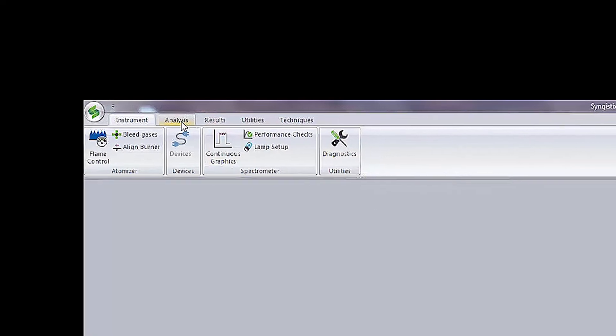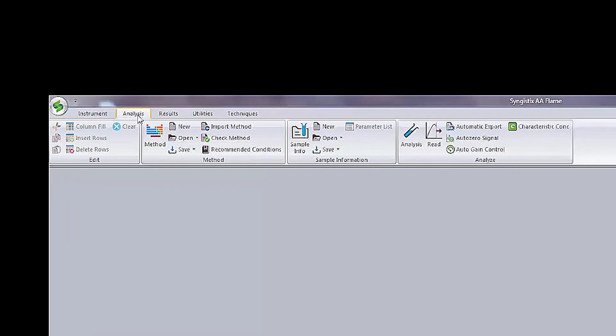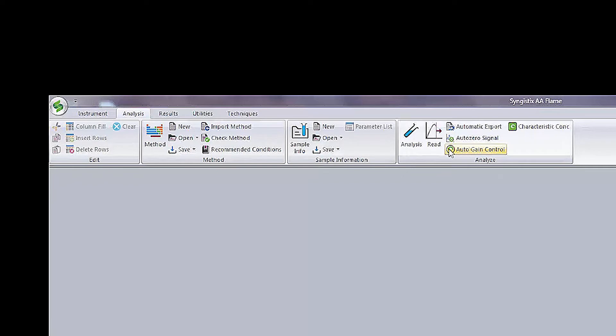The second tab is the Analysis tab. Here you can edit features, manage methods, and input sample information as well as setting up your analytical run.